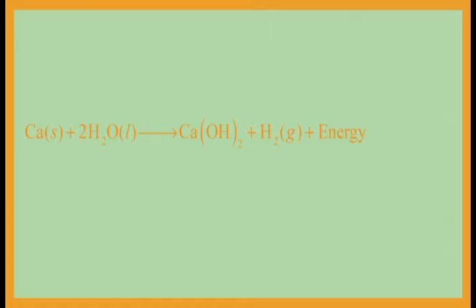Therefore, the initial calcium hydroxide that forms will be aqueous and soluble in water. As more and more calcium hydroxide forms, it will precipitate out of solution as a white solid. Hence, as we let the reaction continue, the solution in the beaker becomes cloudy due to all of the calcium hydroxide that is precipitating out of solution.